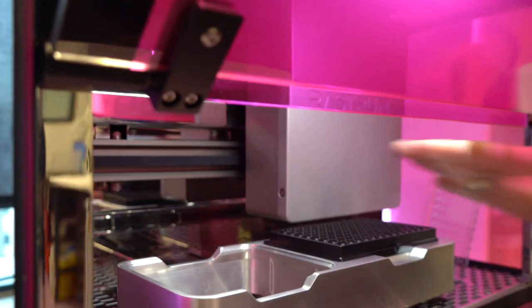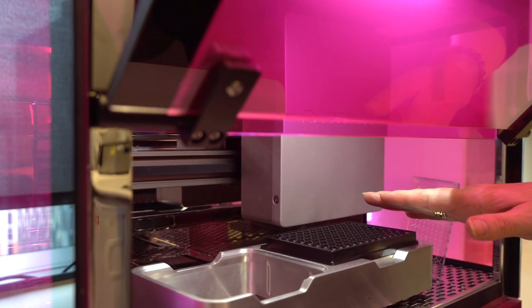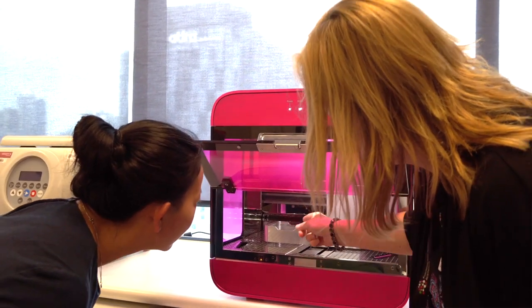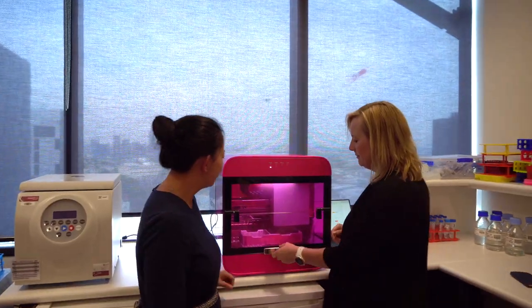This robot head sitting right behind us here will pick up the bio-inks, pick up the cells, mix everything together in this plate, and do all that in about five minutes. If we were a standard researcher sitting on the bench, we'd be taking hours to do something like this. A process involving many different patient samples could take us days and days to get through.